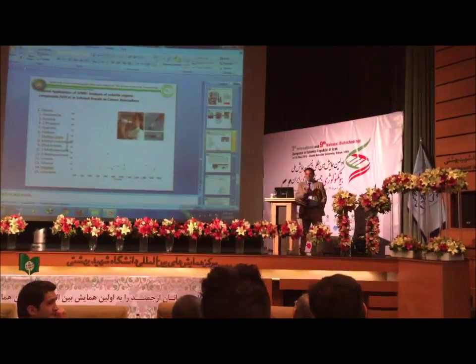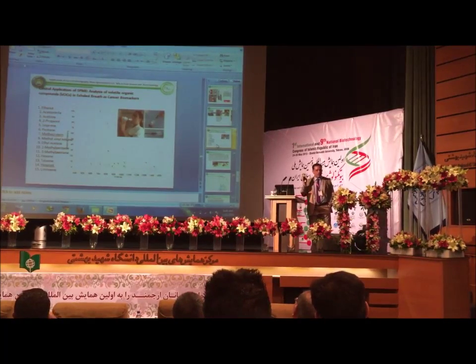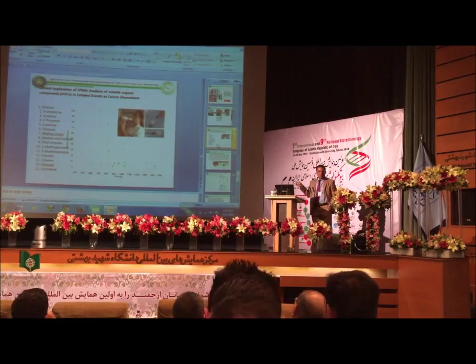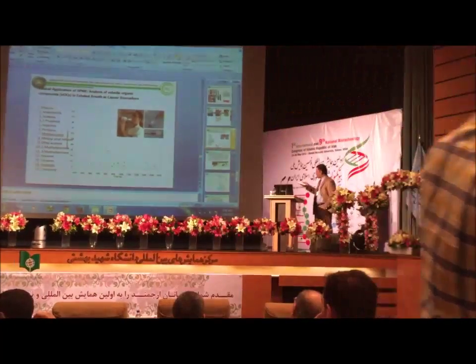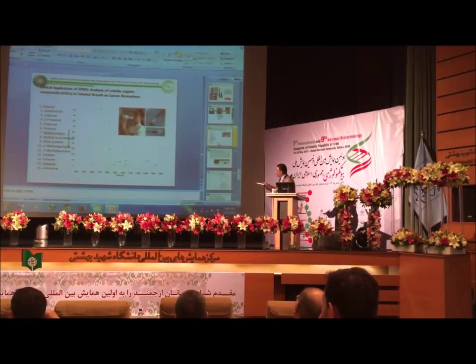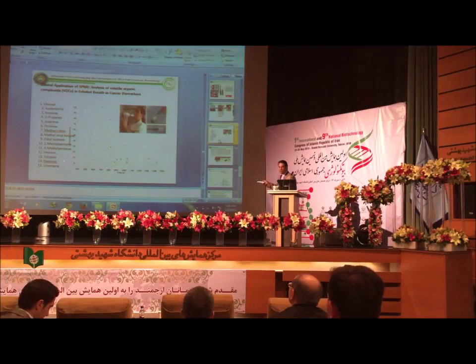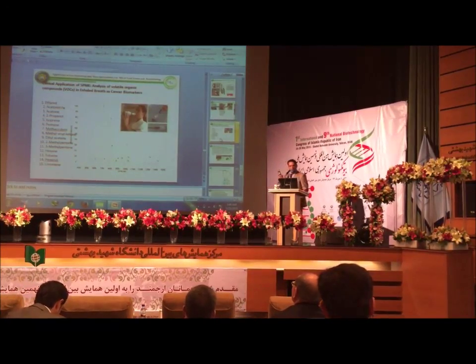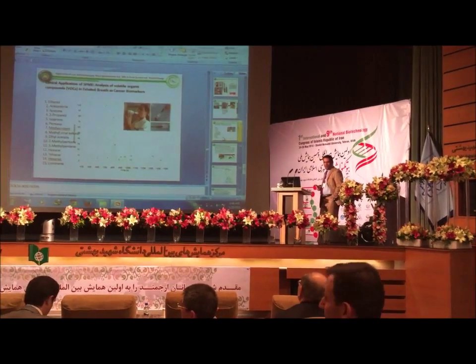For that reason there is no big difference between the first technique and this technique, because all the compounds appear with this technique. For example, look at all these compounds in only human breath. And many papers use this technique for essential oil.